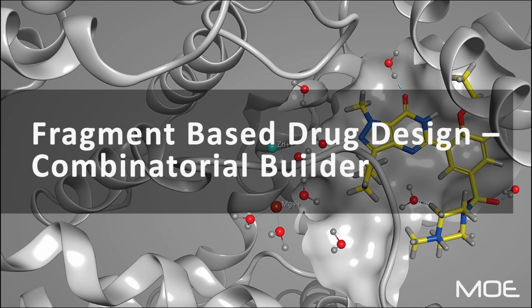Today I'd like to demonstrate the fragment-based drug design tools that we have in MOE. In this example, we'll be exploring the Combinatorial Builder, which is a useful operation when we want to generate combinatorial libraries by placing energetically allowed alternatives simultaneously at several attachment points. So let's get started.